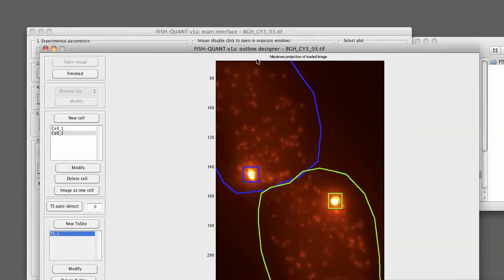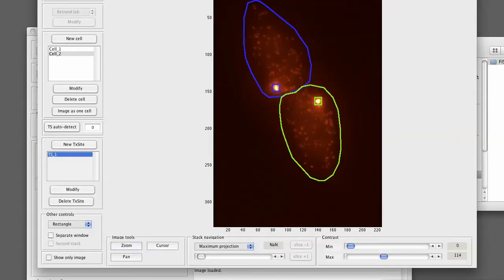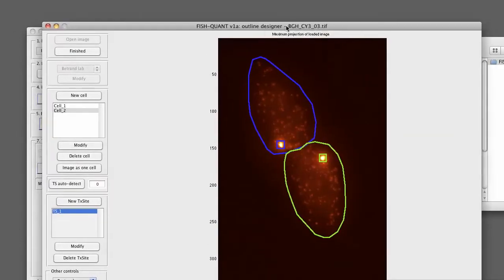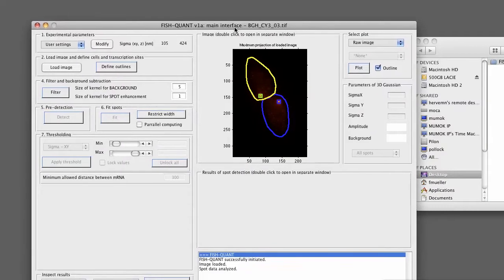Now we are done. We can zoom out and see the two outlines that we defined. By pressing finished, we go back to the main interface. So now we have the two outlines defined with their transcription sites.